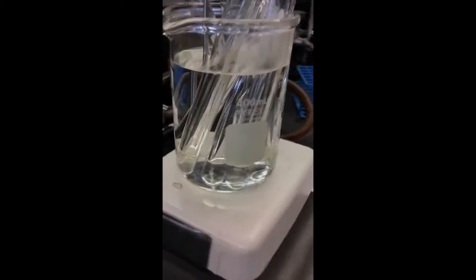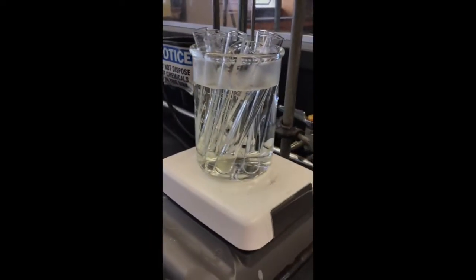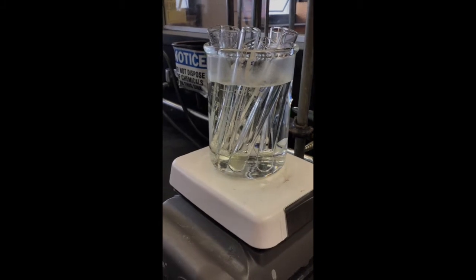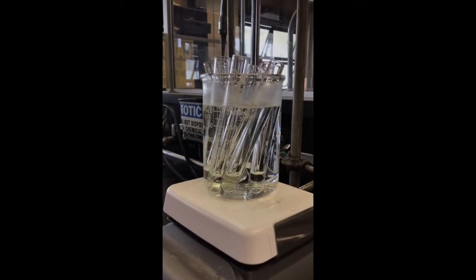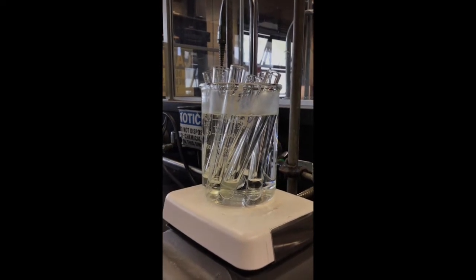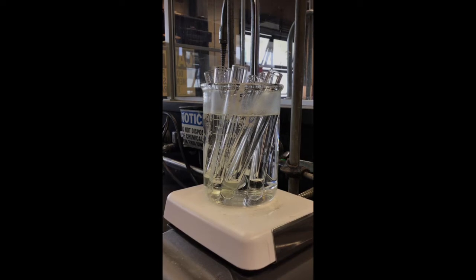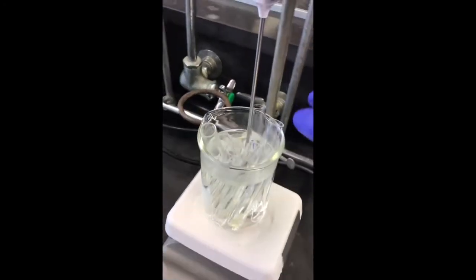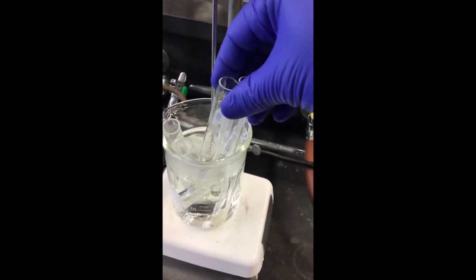And then we'll take them all out, let them cool to room temperature, and then we'll see what they've got. Okay, so that was definitely plenty of time. So what we're going to do is take these bad boys out.